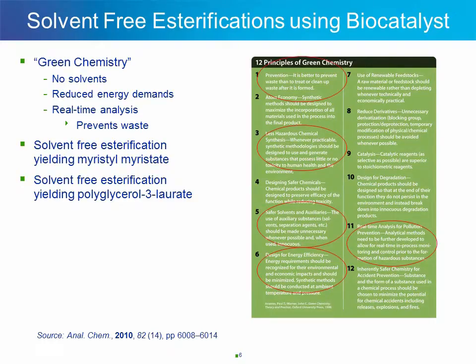I attended a conference several years ago on industrial biotransformations where I first met Professor Liese. It struck me that biocatalysis can result in very green processes, and this is a perfect example. The current industrial method for these esterifications requires solvents and high temperatures, resulting in high energy demands. Real-time analysis is a green way to provide analytical information, and not only is the information provided without having to use solvents such as acetonitrile and HPLC, but real-time information results in better processes, which can lead to less waste.